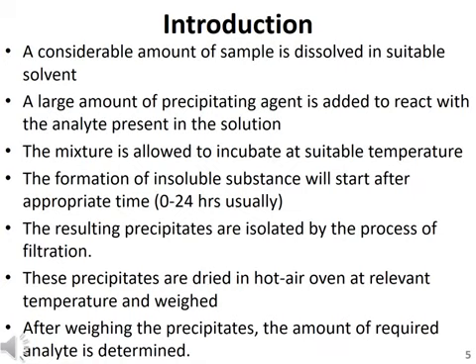So it depends upon the process and upon the precipitating agent and the solution analyte that you are going to mix. After the formation of the precipitates, these precipitates will be separated or isolated by the process of filtration.